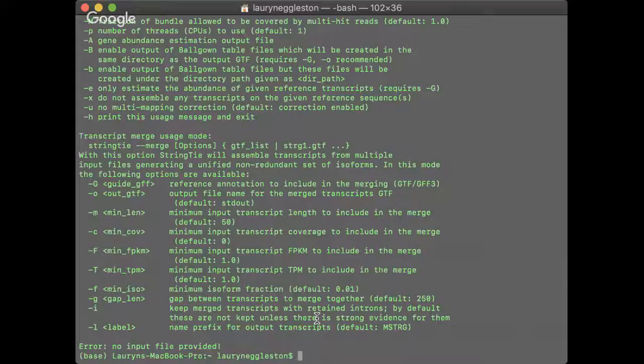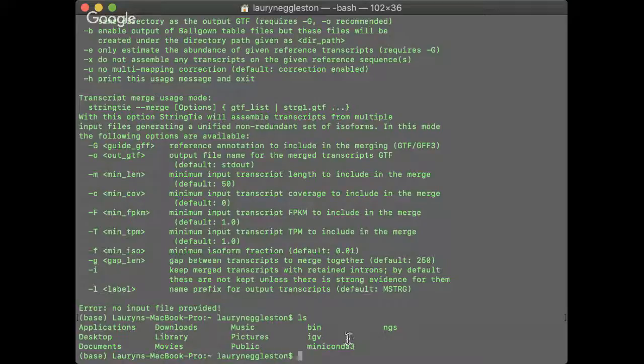I've got Miniconda on my laptop, and I was able to download HiSat without any problems and StringTie without any problems, but I was having difficulty with the SAMtools download from Conda. It wouldn't run once I had completed the download and tried typing in samtools to verify that it was downloaded.